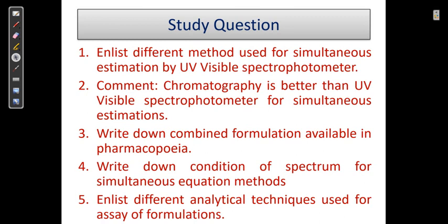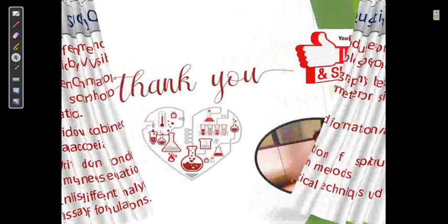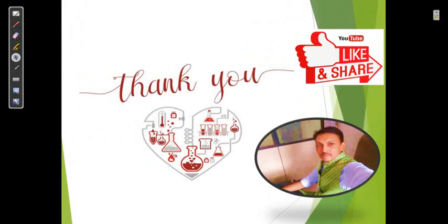So this is my attempt to show you how to calculate the simultaneous equation method, which will help you understand the concept of the absorption ratio method.